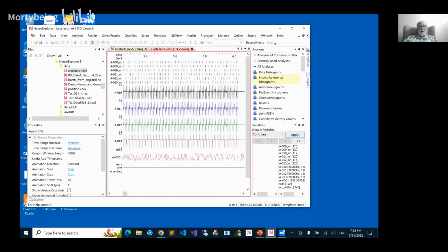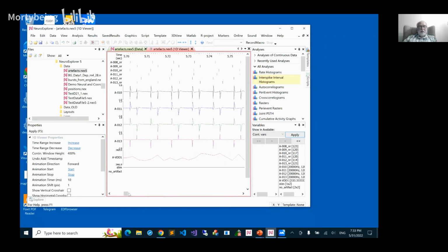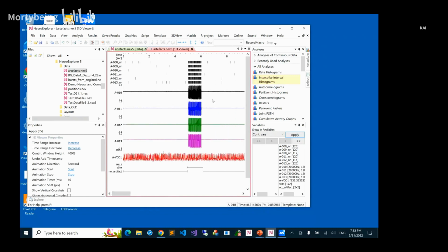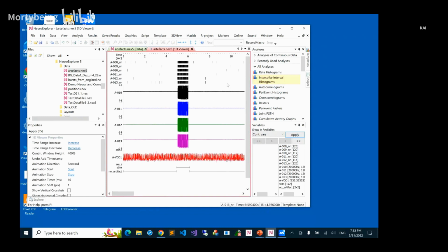Okay. So if I'm understanding correctly, you mean we just ignore that noise time period, and we just exclude it from the calculation. Yes. But sometimes, for example, some kind of noise is long, maybe it affects the whole recording session.